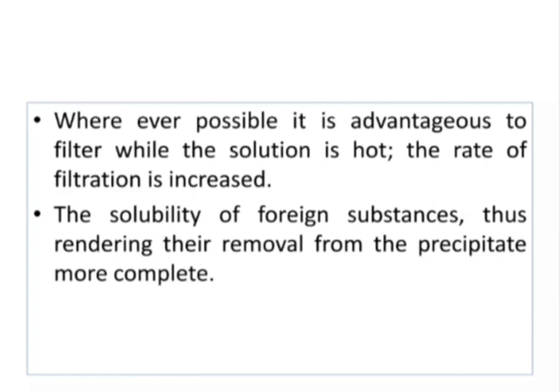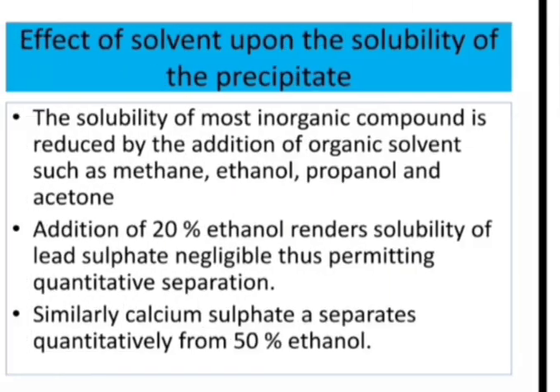Wherever possible, it is advantageous to filter while the solution is hot. The rate of filtration is increased, and the solubility of foreign substances is also increased, thus rendering their removal from the precipitate complete.